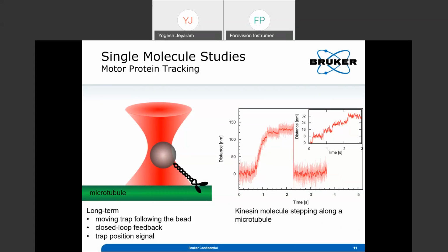So I have some questions here. I will take them when I can. So there are some questions, for example, how do you attach beads to the DNA as both are moving? How can one measure the stretching force in this case? So you attach the bead, you trap the beads first. The beads are moving, then you trap it. Once you trap, the beads are not moving, right?